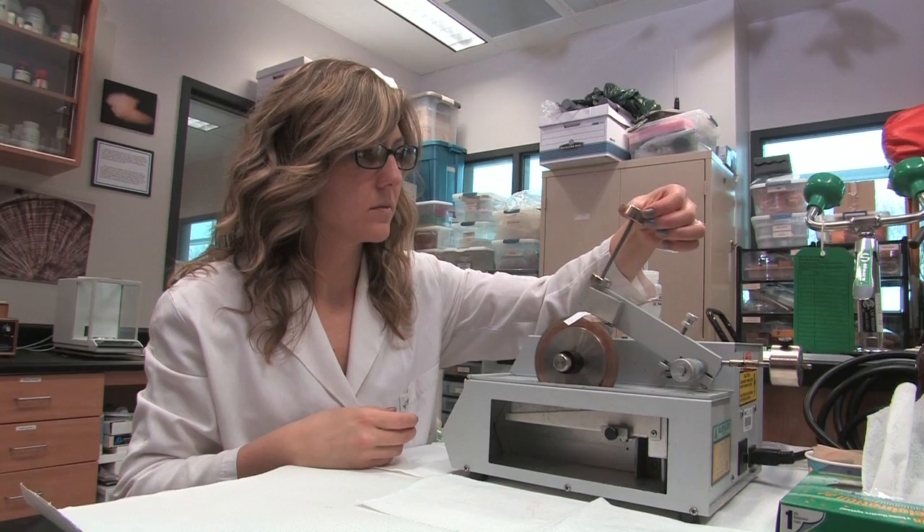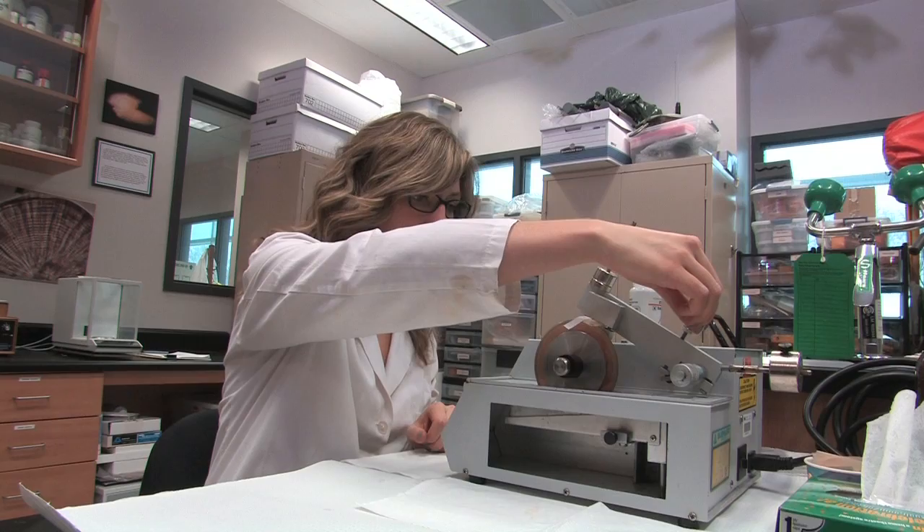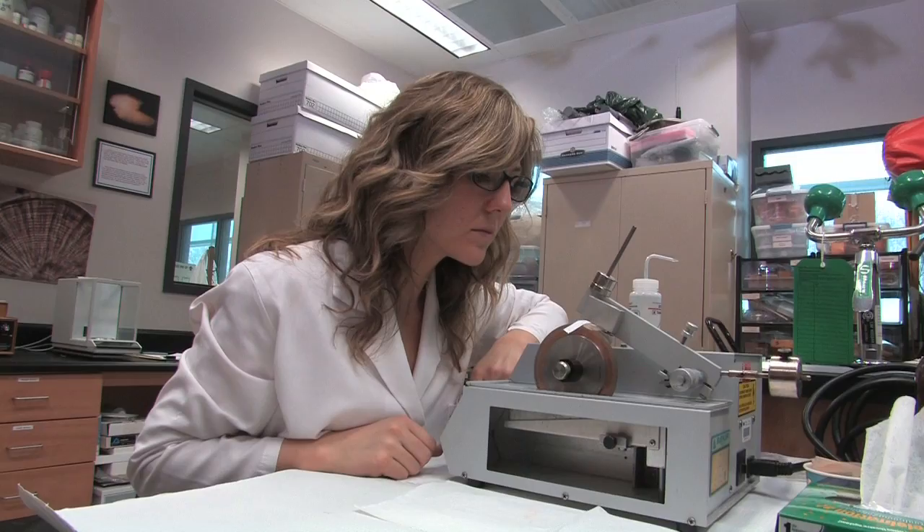This video demonstrates production methods for sectioning individual otoliths and shark vertebrae on an isomet diamond wafering blade saw. This process takes approximately five minutes and will produce thin sections of otoliths which will be used for age determination.